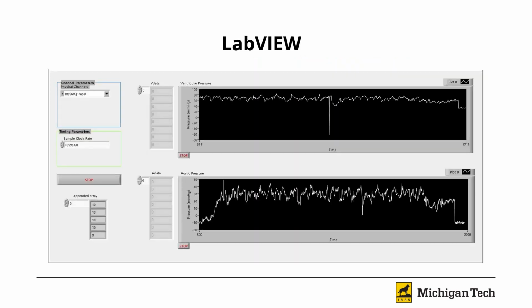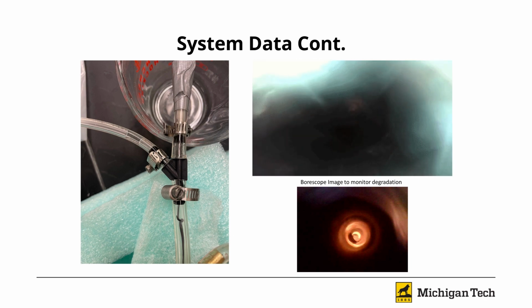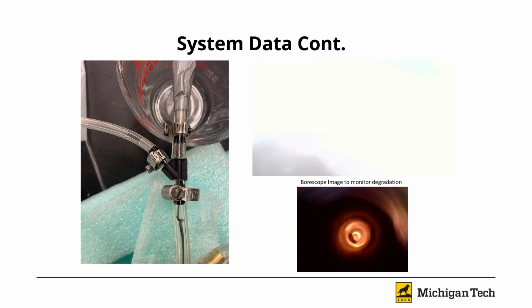LabVIEW was used to control the bioreactor and to record data. Here is the front panel of the code. A borescope was used to record live footage of the stent. Here is a video and an image from the borescope.